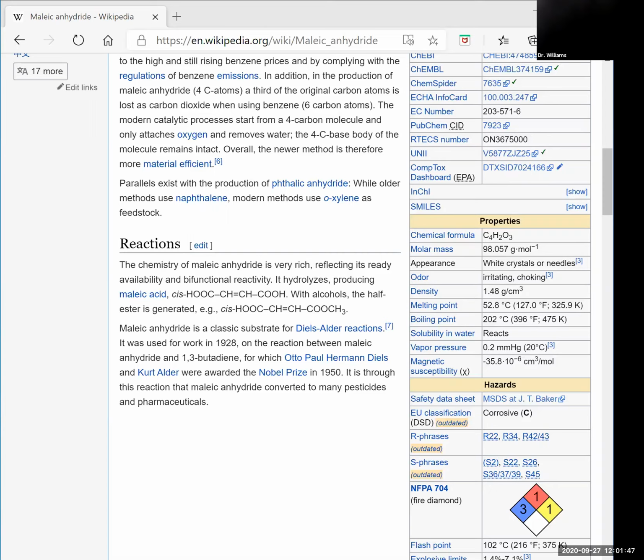52.8 degrees centigrade. Make sure when you look this up that it's in centigrade, or convert to centigrade if it's in Kelvin, because the apparatus only allows you to put degrees centigrade. So it's 52.8. We want to ensure that we reach a temperature around 52.8 for a sample that we've synthesized.